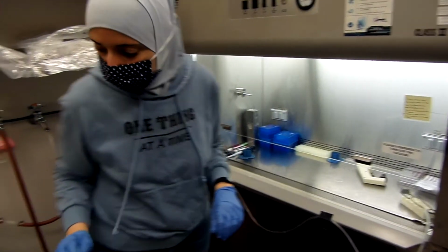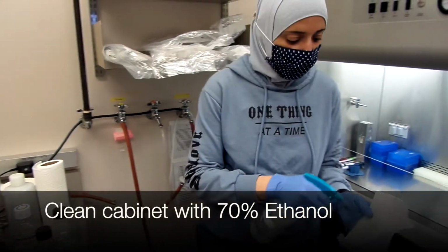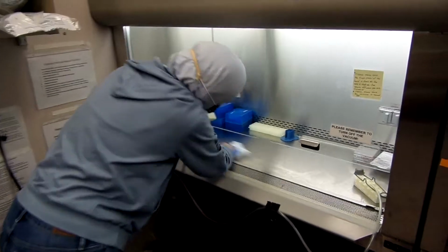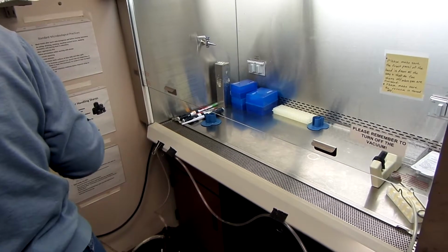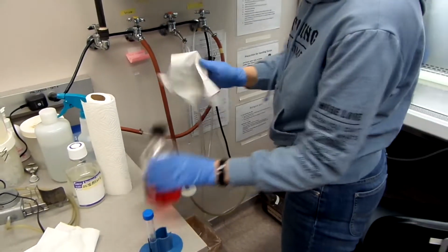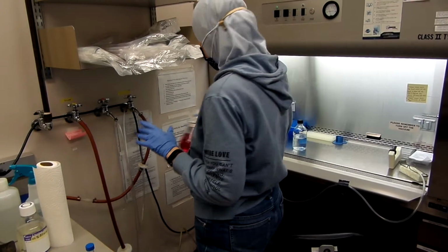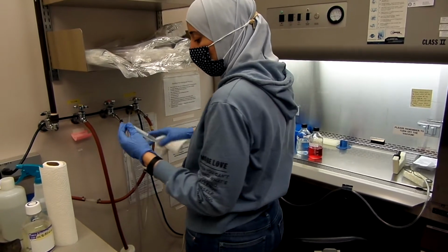The first thing we do is to spray and clean the biosafety cabinet hood with 70% ethanol. Anything that goes inside the biosafety cabinet has to be wiped with ethanol. So I have phosphate buffered saline that is sterile. I have the growth media, and each cell line, each primary cell type has its own growth media, and I have trypsin, an enzyme that we use for splitting cells.